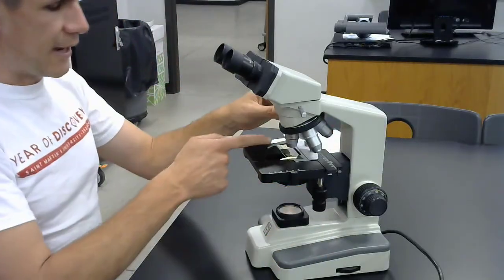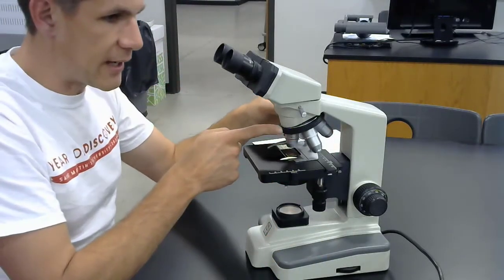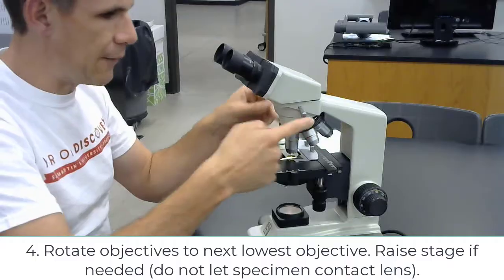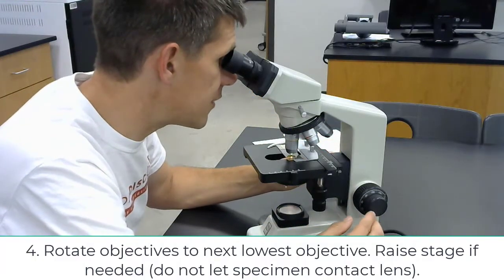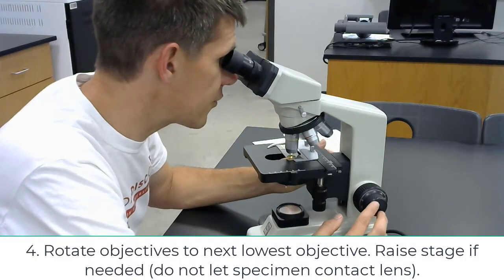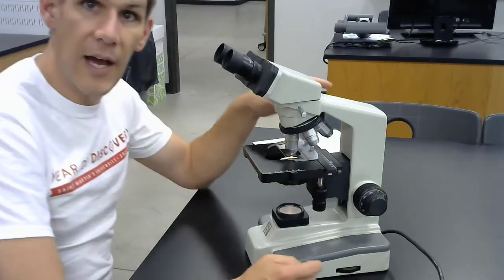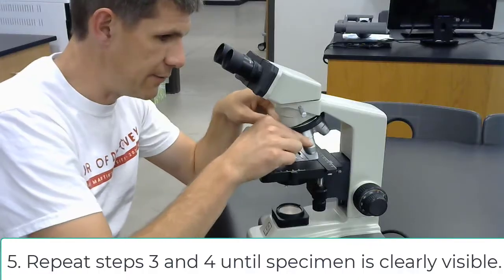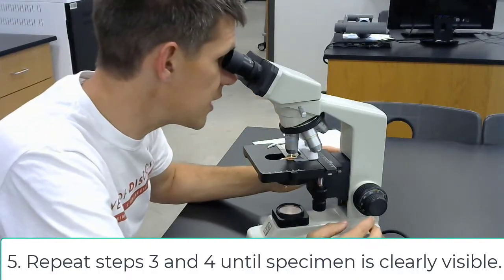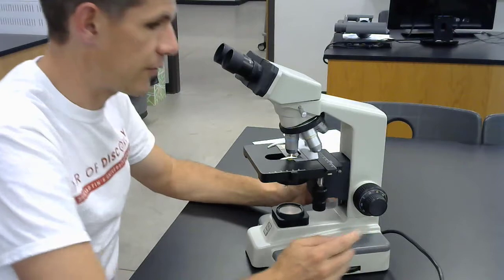So now that I have this in focus, I can rotate the objective to the mid-power and then, only using the fine objective, gently and slowly move it until it is in focus again. Then I can use any higher objective and very gently move it until it is in focus again.